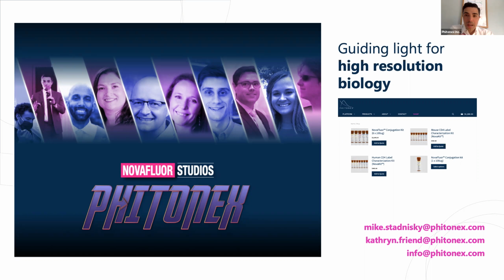I think honestly over time, it'll probably be one of these other inflammatory things. We'll tell people to turn down the gain in the red. APDs are naturally more sensitive in the red, right? So you could save yourself a lot of headaches in the red by turning that gain down as opposed to going with the default settings.